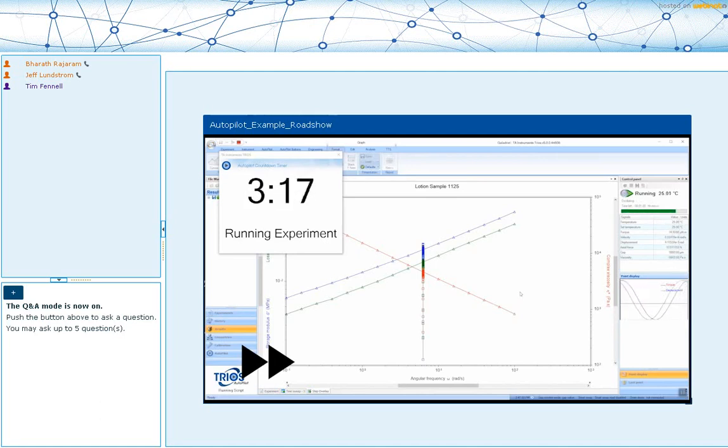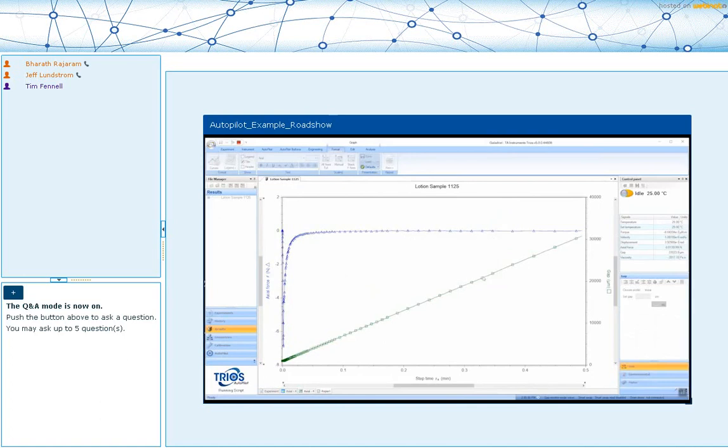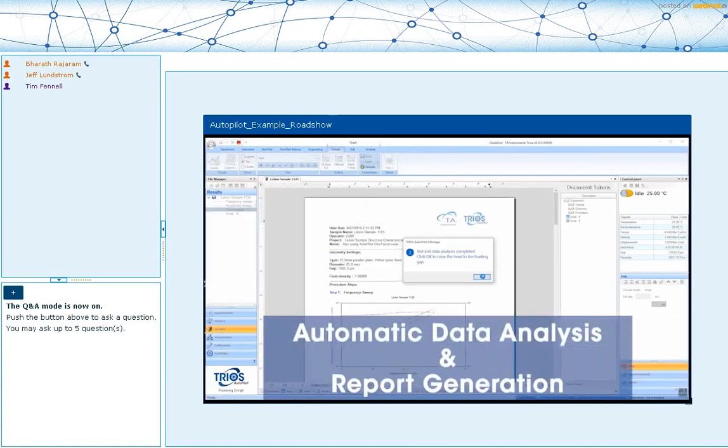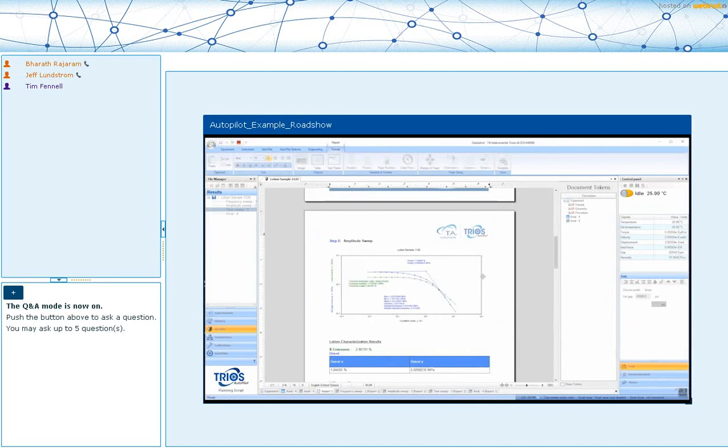So once the sample is loaded, we click OK, and it moves to the trim gap. And once it's at the trim gap, we will again pop up a video to walk them through how to trim the sample correctly. So you need to start over. So there are a lot of checkpoints that we can build in to guide new users to effective instrument operation.